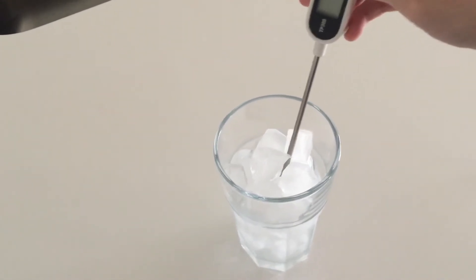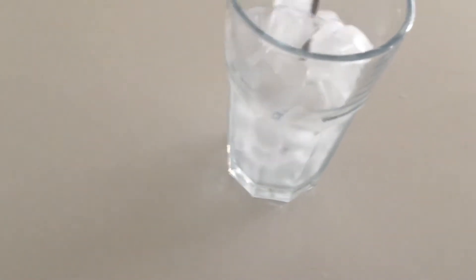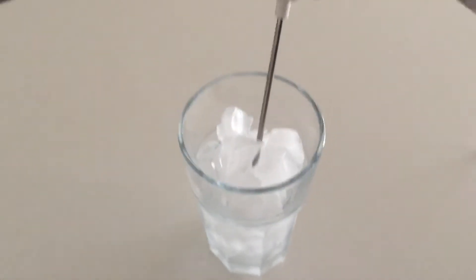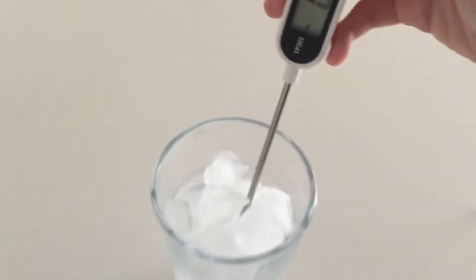Right now I'm doing the calibration for my food probe thermometer. This is the ice slurry method with some ice and water. I'm just making sure the thermometer doesn't touch the sides, and the temperature right now is negative 0.2 degrees Celsius.